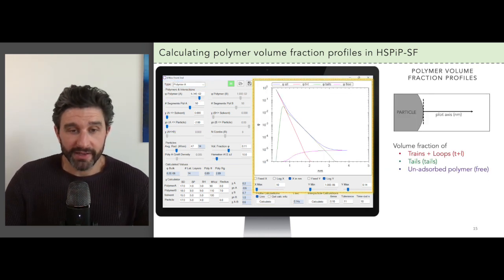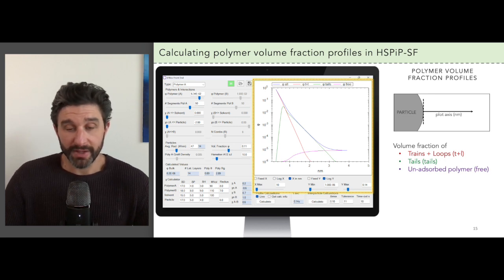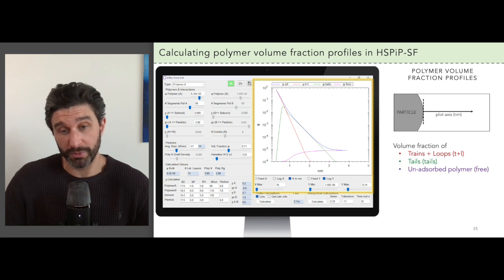So after clicking calculate you see the volume fraction profile output in the plotting window. These profiles are plots of local polymer volume fraction versus distance from the particle surface. The app gives you output for the total polymer volume fraction and also the contributions coming specifically from loops, trains, tails, and the unadsorbed polymers.